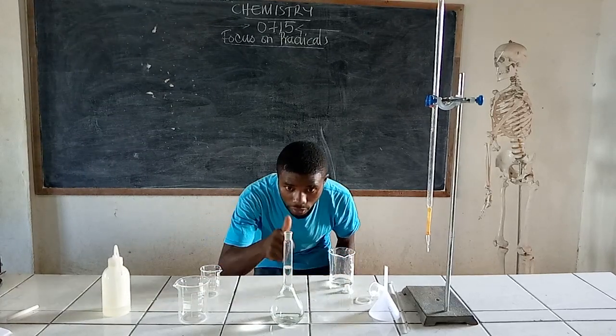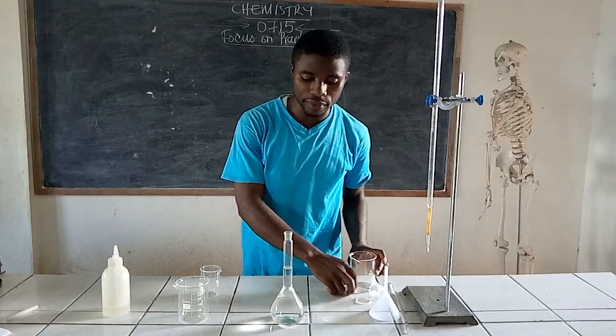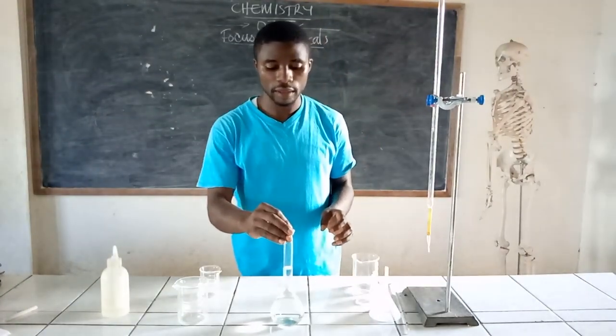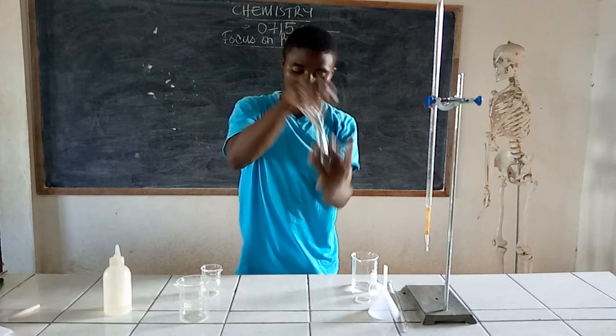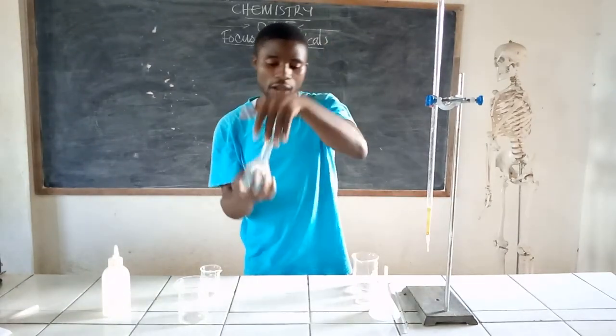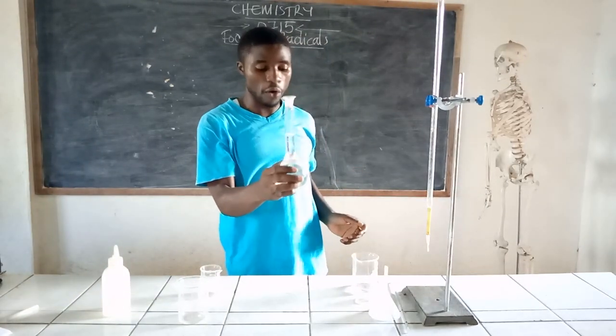I am on the mark. Now I stopper and shake to have a homogeneous solution. What I have here now is a standard solution of sodium carbonate.